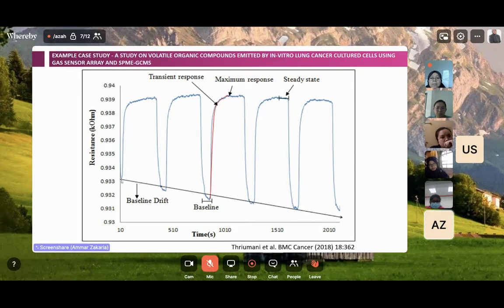So you can see that on the first sniff you have a baseline in this range. Then on the next sniff you have it in this range. On the other sniffs and so on, it keeps going downward, until a certain range where the baseline is far below, and then your response also becomes lower as well. This you need to avoid. This is either due to the temperature or due to the moisture. You need to be careful as well.